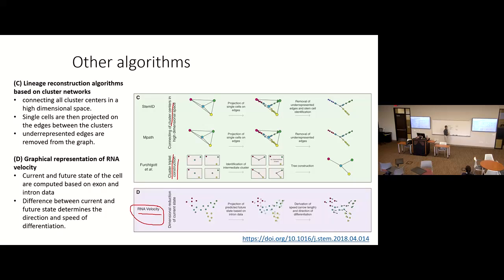So this 10 will be separated into maybe 5 and 5, okay? It means this gene in this cell, number 1, has half of its counts from unspliced mRNA and half from spliced.